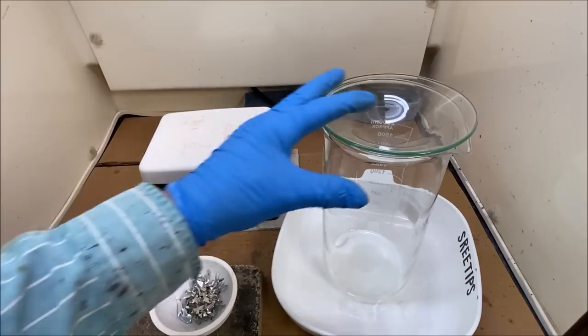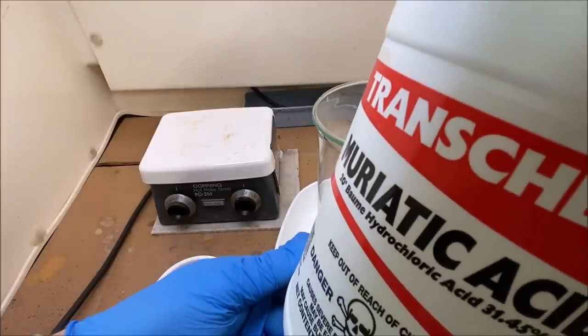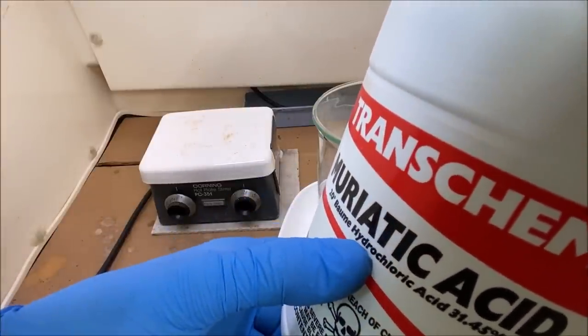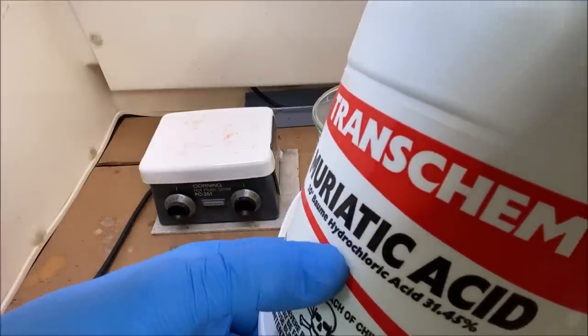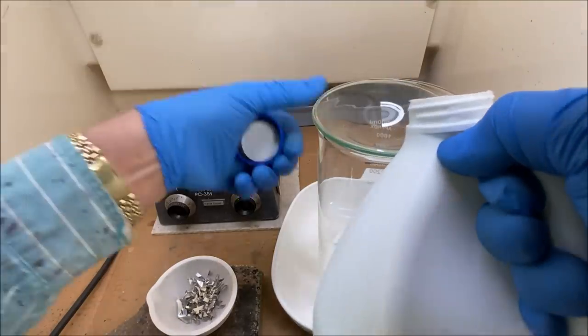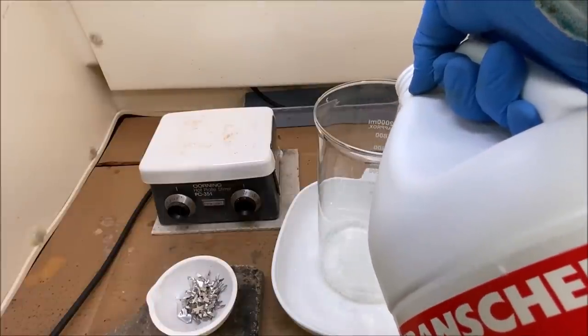I've got a beaker here with a stir bar in it. I'm adding some hydrochloric acid. Hydrochloric acid is the same thing as muriatic acid. Muriatic acid is the same thing as hydrochloric acid. So we're gonna add about 200 milliliters of hydrochloric acid to this clean beaker with a stir bar in it.